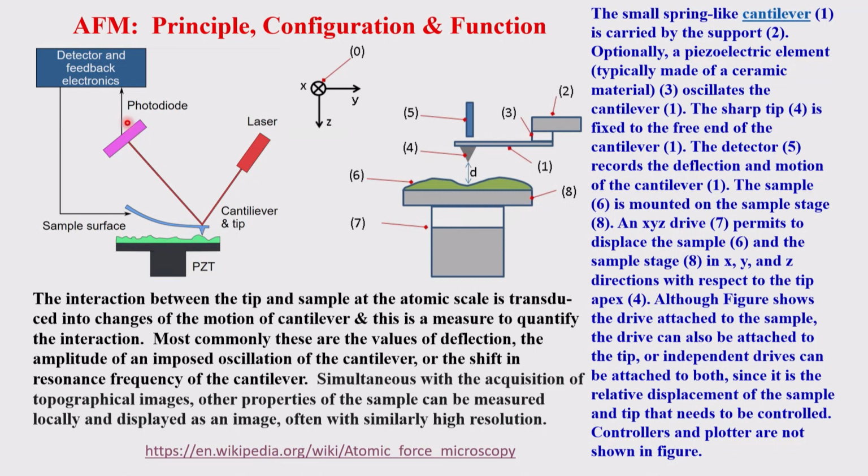All of these you can measure. This is what you call a photodiode detector, and that is connected to the detector. This will have the sample surface, and this will measure and give you the output in terms of the photons, photocurrents, etc.